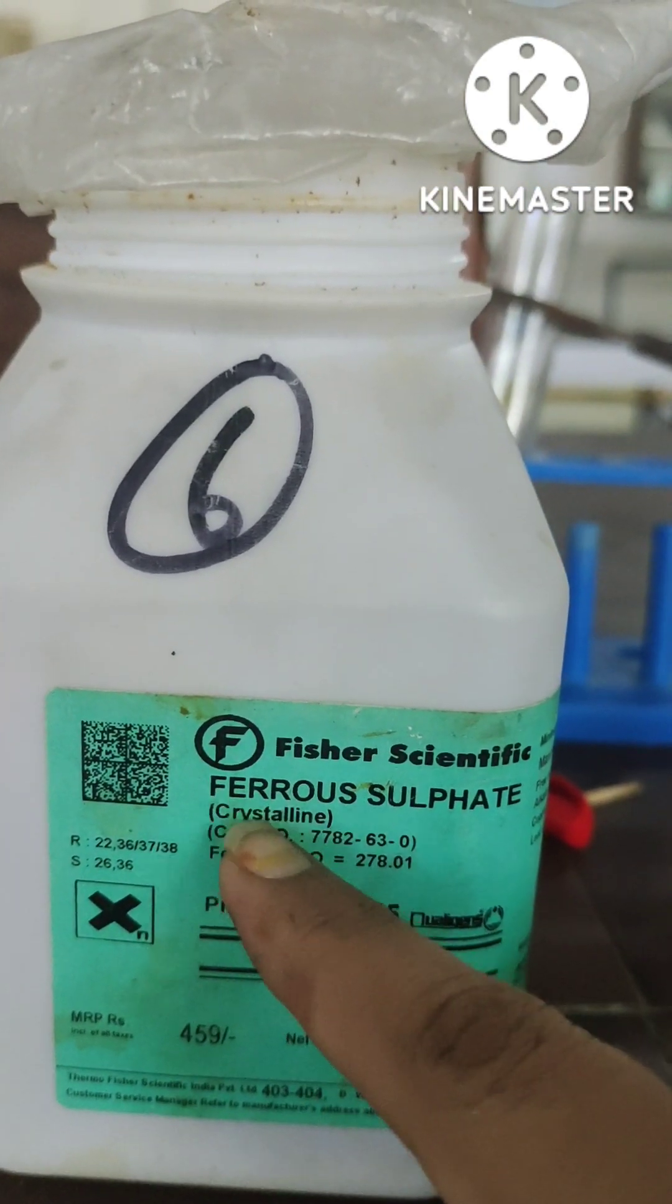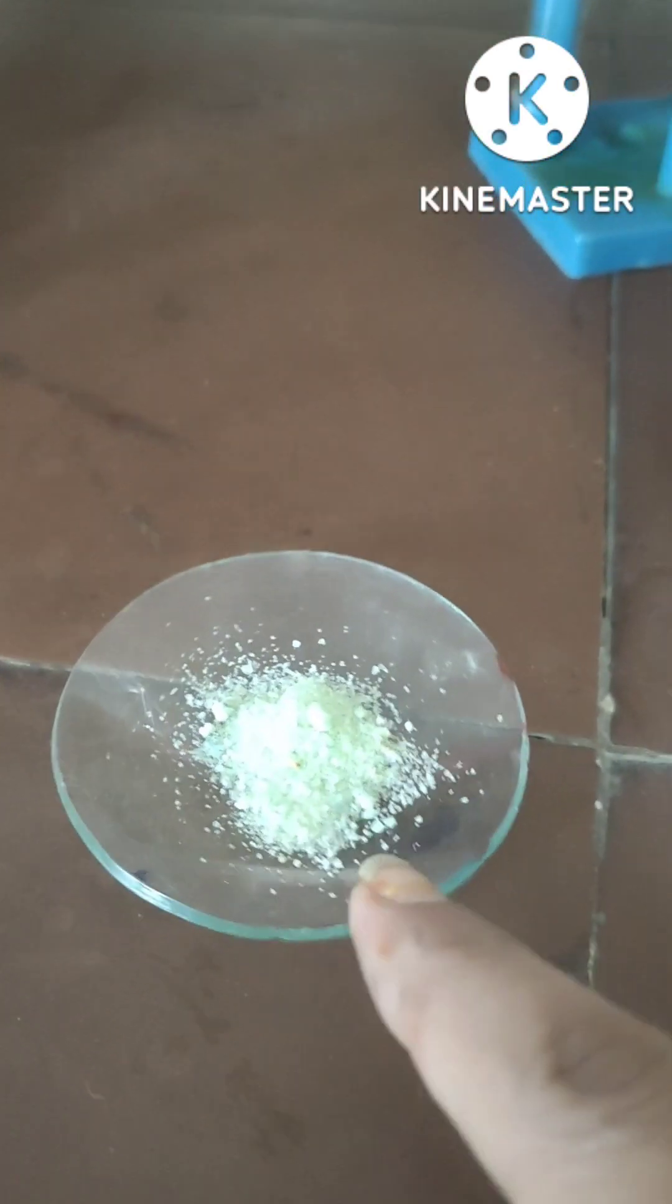Hello everyone, today we are going to see one more chemical, and that is ferrous sulfate. It is pale green in color.